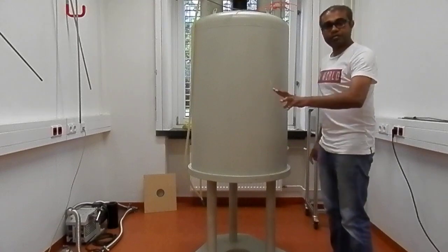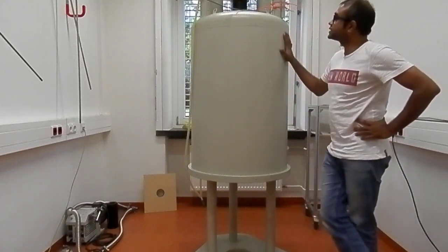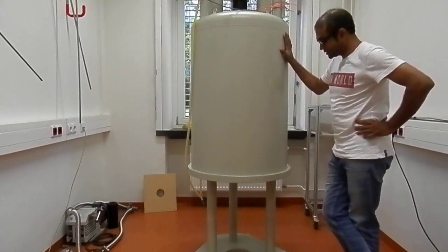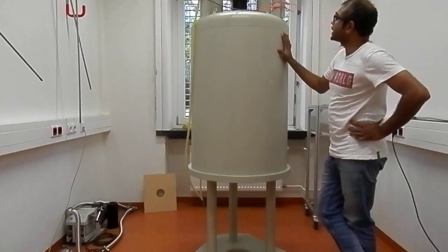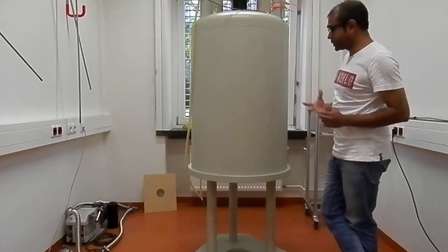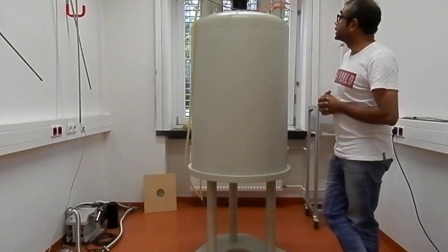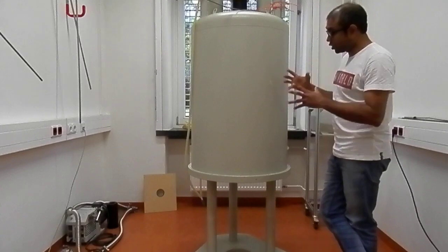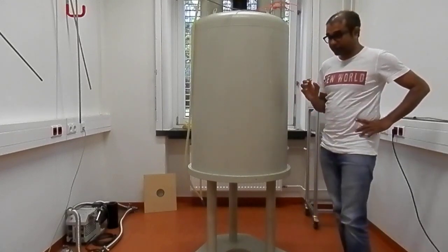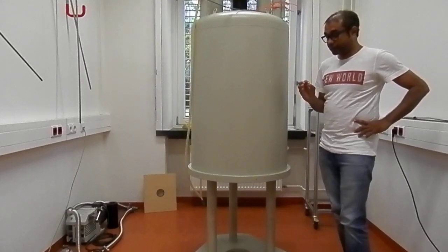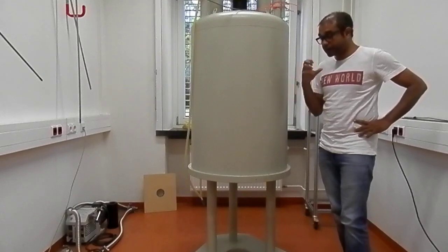Today I will show you a few experiments with this 7 Tesla high homogeneity magnet. This is actually an NMR magnet, and the homogeneity is better than one part per million. It has a really strong field, and I would like to show you some experiments demonstrating how strong and effective this magnet really is.